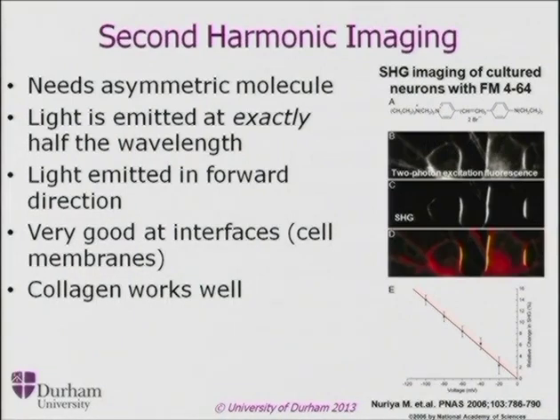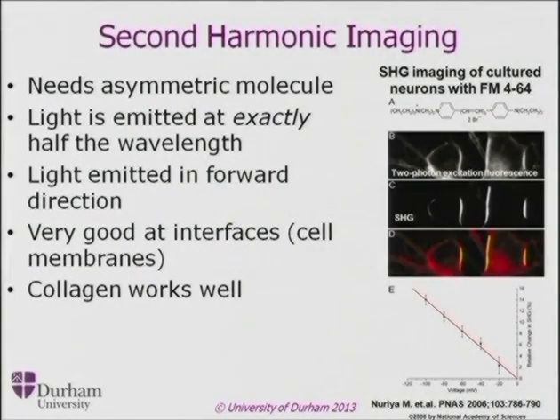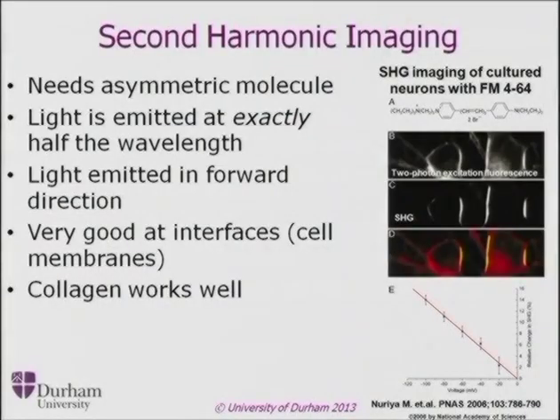The crucial bit is there's no fluorophore. It's because of the shape of the molecule and the way that the light wave drives it vibrationally, or not quite vibrationally, the way it drives the electrons around. And the wavelength comes out at exactly half. And this green laser pointer works on second harmonic generation. So inside here is a laser that's operating at 1064 nanometers. There's then a crystal at the front, and the light going onto that then comes out at exactly half the wavelength, twice the frequency, i.e., in this case, green.